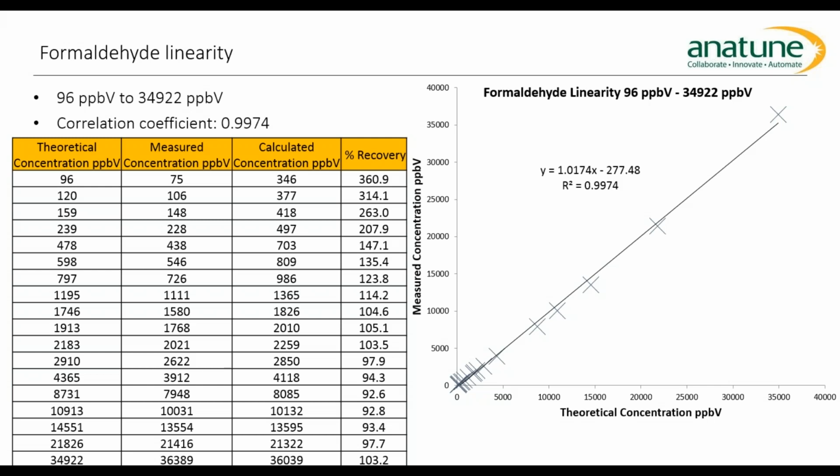And you can see actually for the low end concentrations down in the 100 to 200 ppbv, it is massively over recovering. And the reason for this was because the top data point at 35 parts per million by volume is actually right at the top end concentration range for SIFT-MS in this setup, and it tends to have quite significant weight on the system.